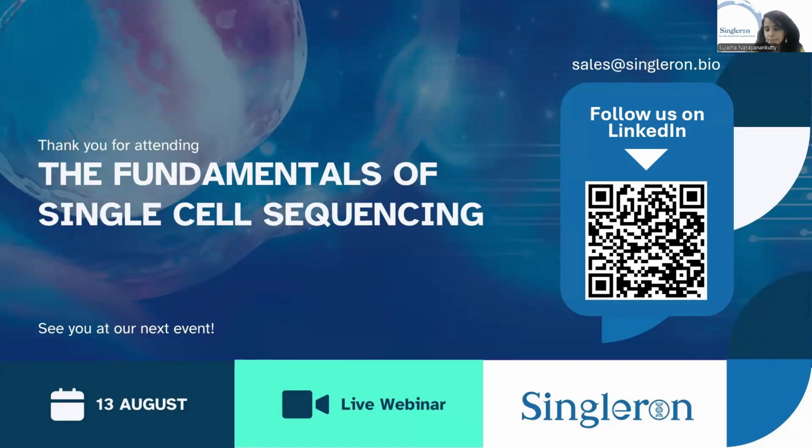Okay, thank you, Sujata. Someone else also asked, what is the minimal amount of samples that we can start with for single cell sequencing, and also how to avoid noise disturbance during analysis?